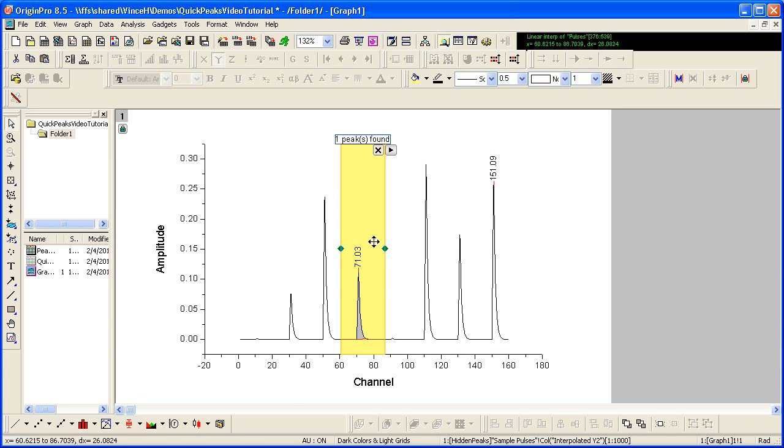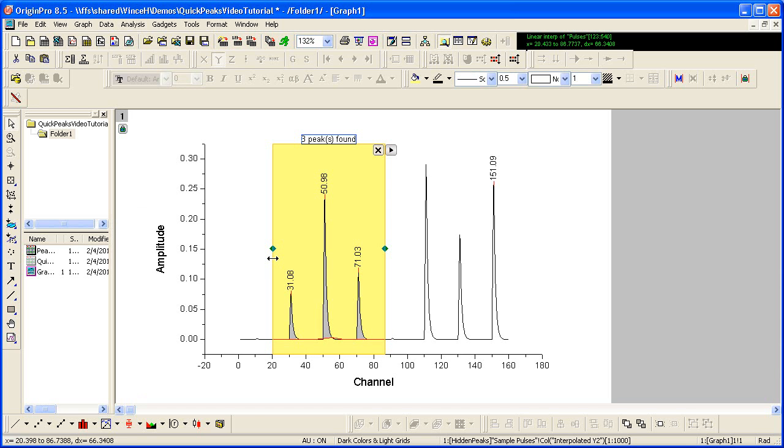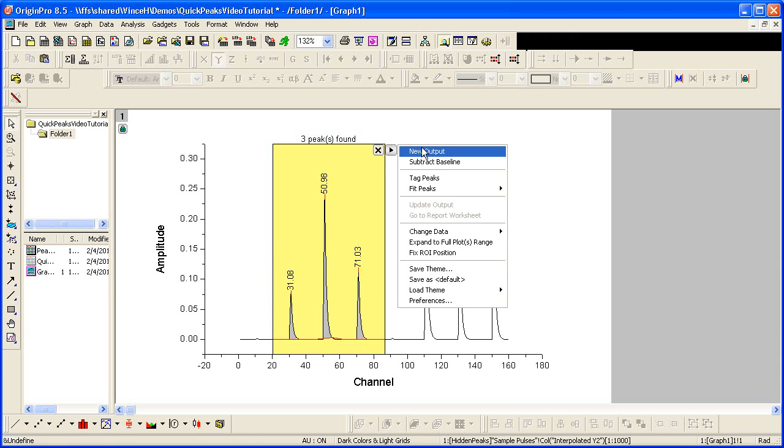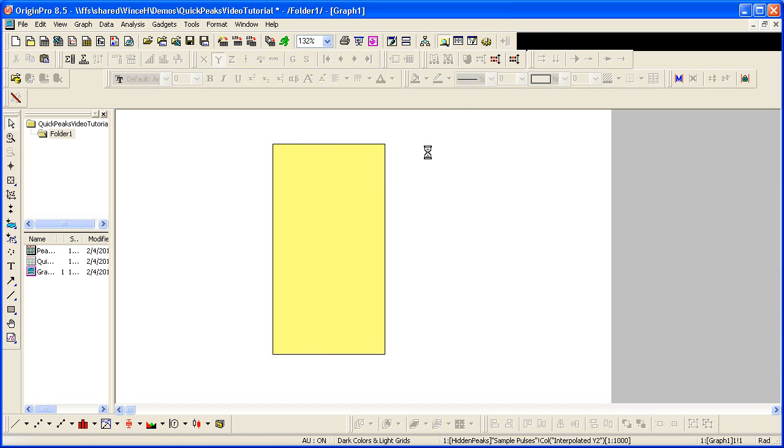Note that a tagged peak will not be included in any output that I do. The next action I'd like to take is to select the three leftmost peaks and choose to output data for these peaks.